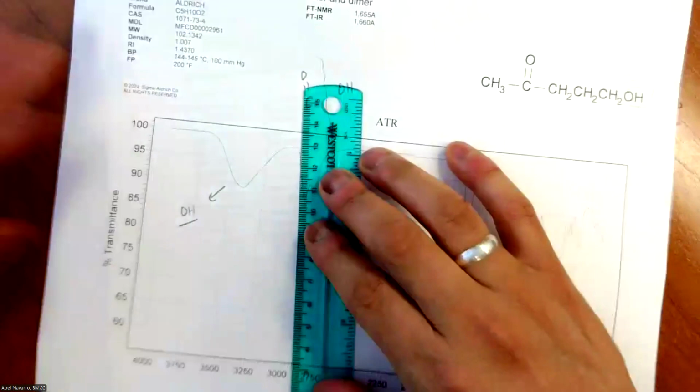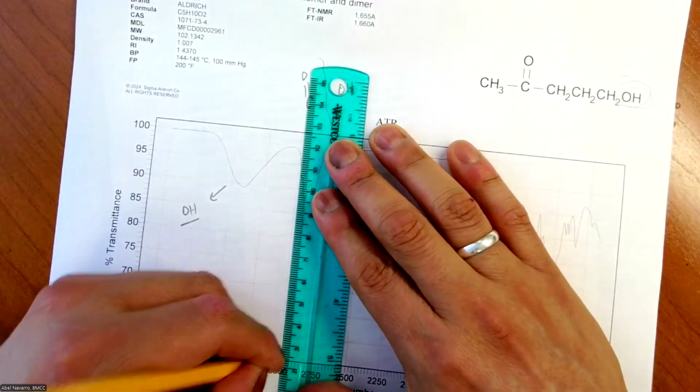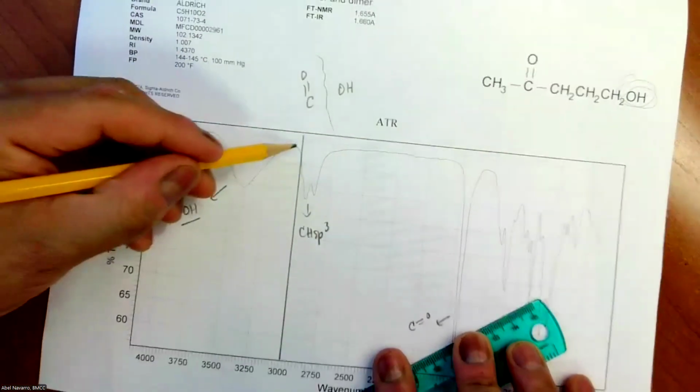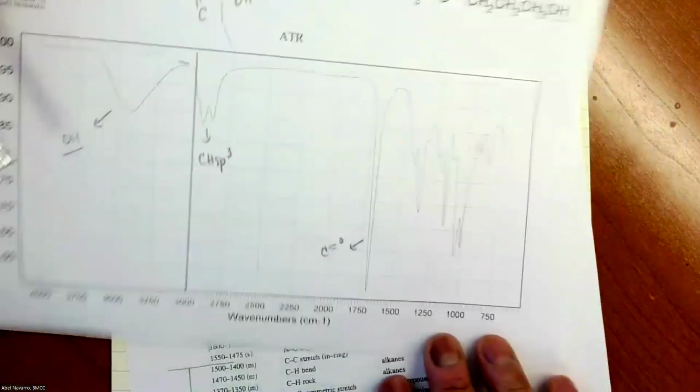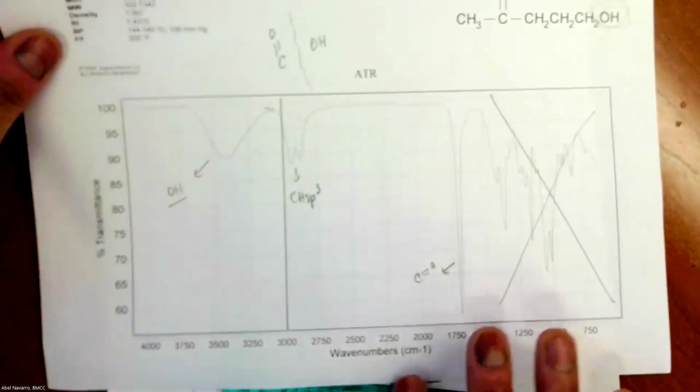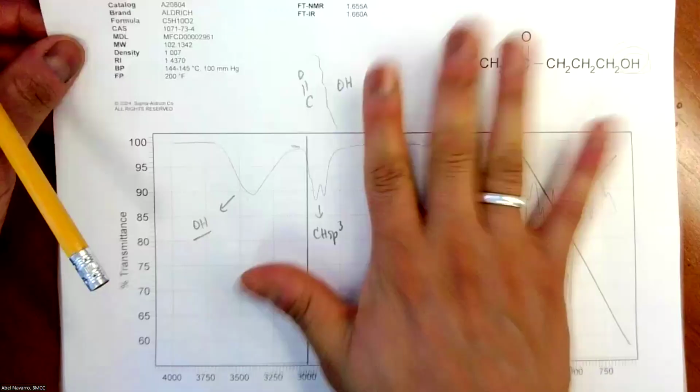Just finish labeling this. CH sp3, no CH sp2s, OH, C double O. And that's the fingerprint, right? And we finish the assignment for this compound. Make sense? Please, once again, let me know if you have questions.